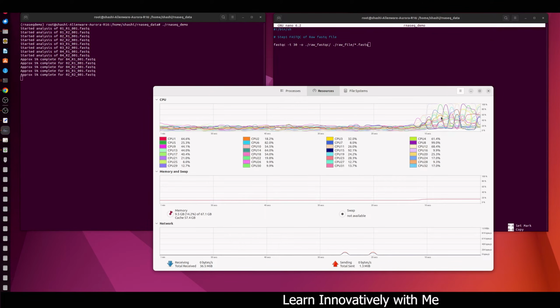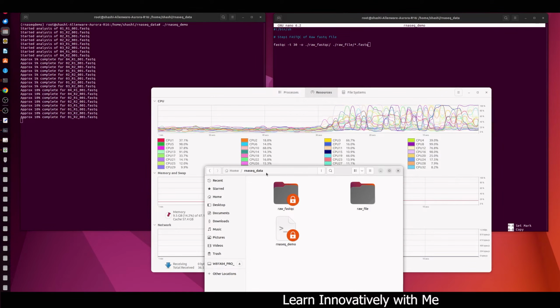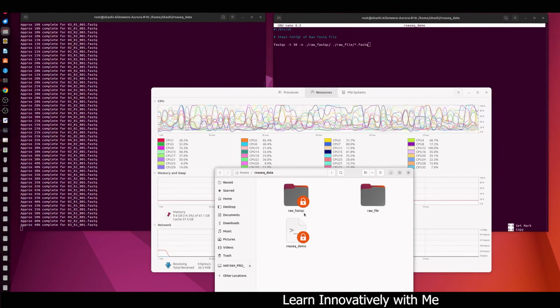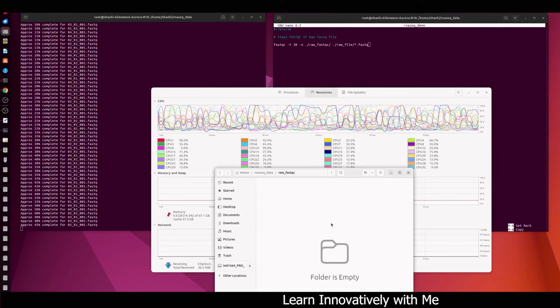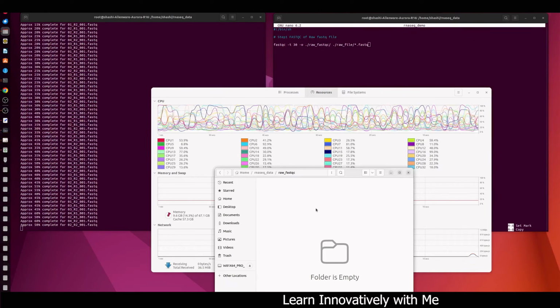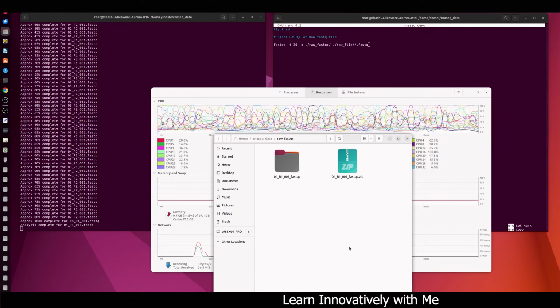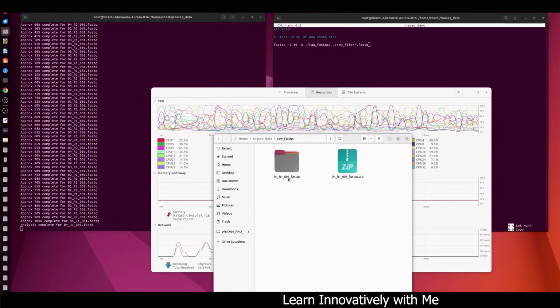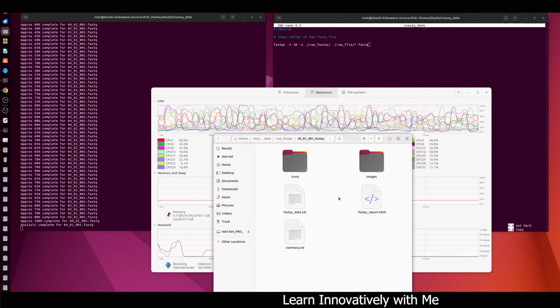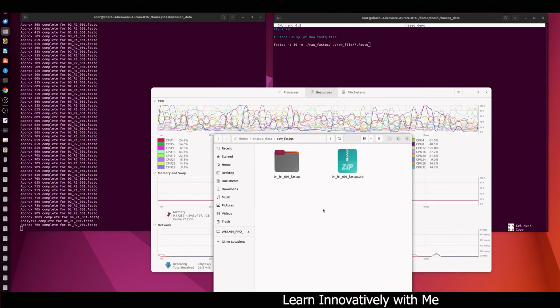All the 30 CPUs are now busy with the analysis. If you open the RNA-seq data directory, which has the raw file directory and the raw FastQC directory, there is no file available right now, but after the FastQC analysis all the files will be available in this directory. For the 04R1 read, the FastQC result is available right now, and if you open this you can see the result. So after some time all the results will be available in this directory.